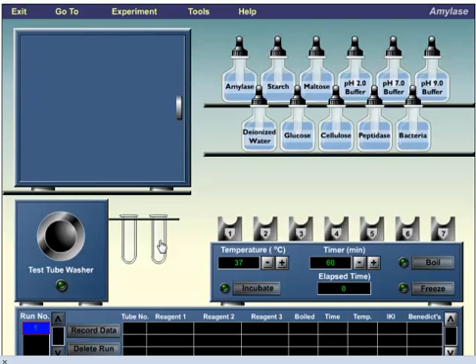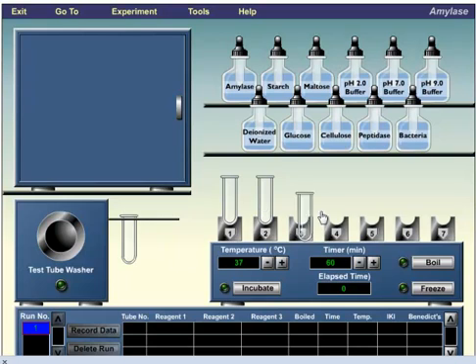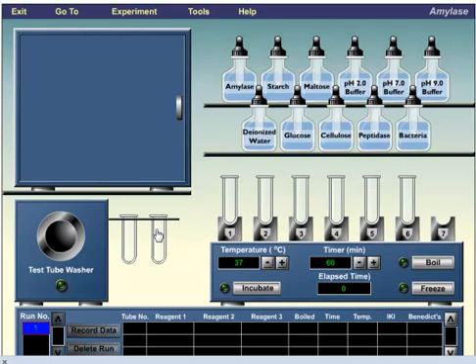Let's assume the instruction asks me to take seven tubes, so I'm going to take one, two, three, four, five, six, seven. The instruction says in tube number one add amylase.